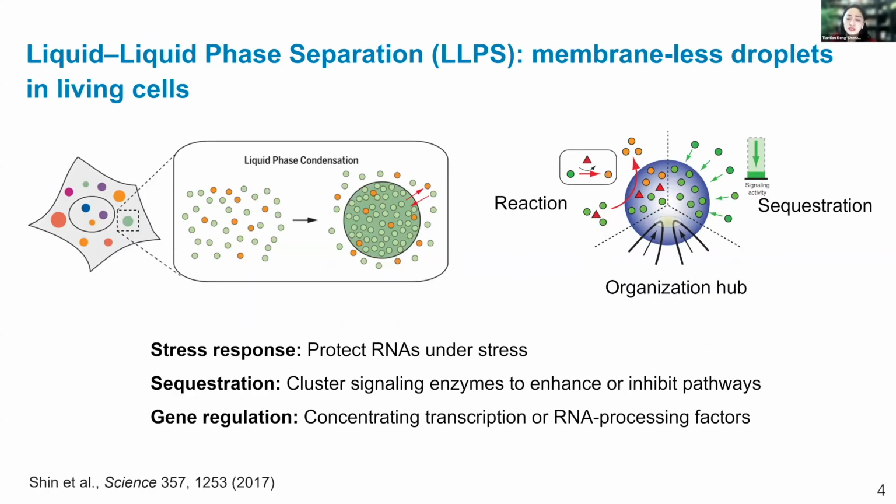In recent years, people have found in living cells a different kind of droplet, not formed by water and oil, but formed by liquid-liquid phase separation. In cells, some proteins and RNAs cluster into dense membraneless droplets, such as P granules and stress granules. These droplets dynamically assemble and dissolve in response to changing cellular conditions such as pH and temperature, allowing the cells to respond and reorganize their biochemical processes.